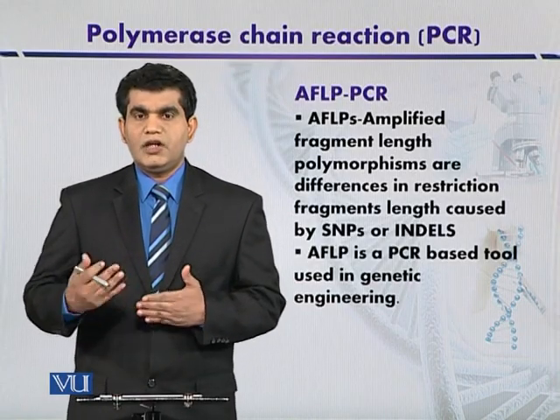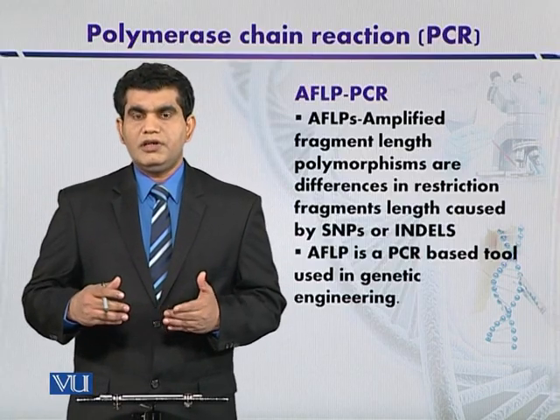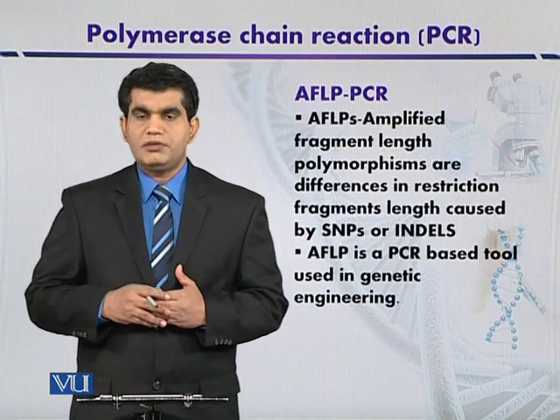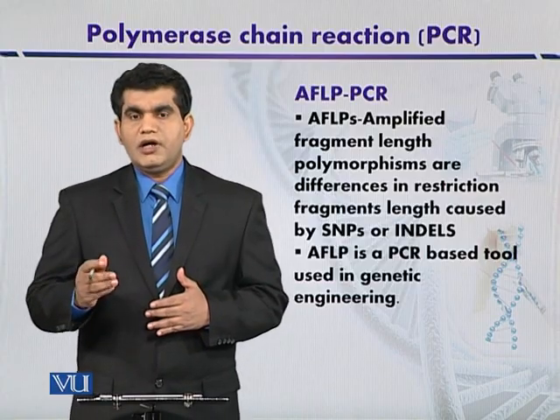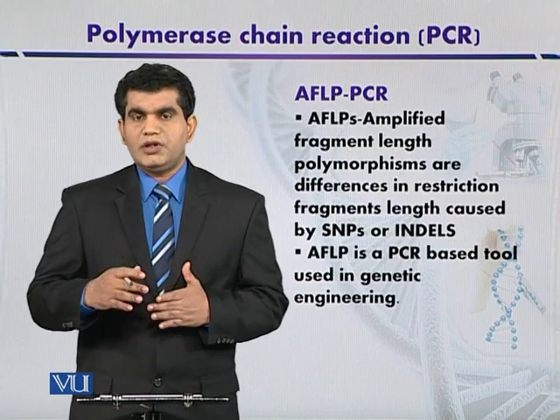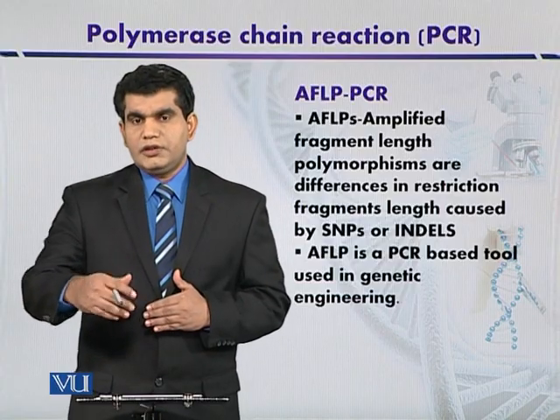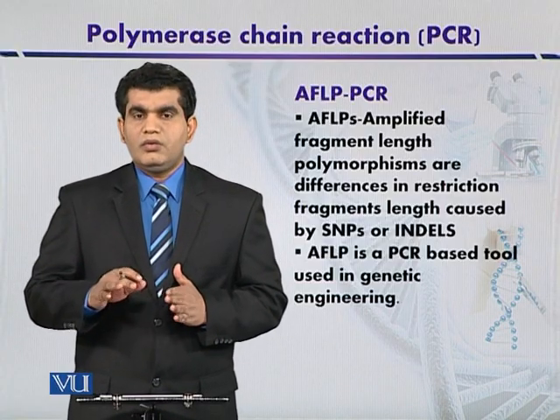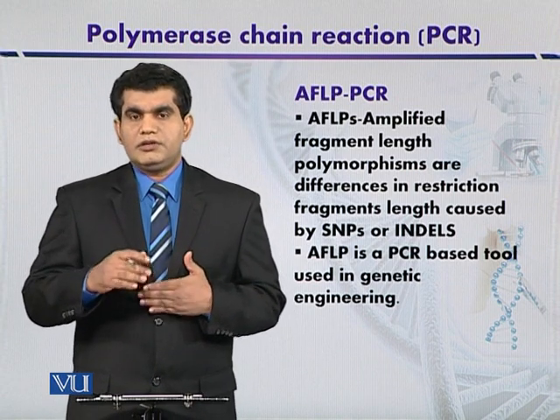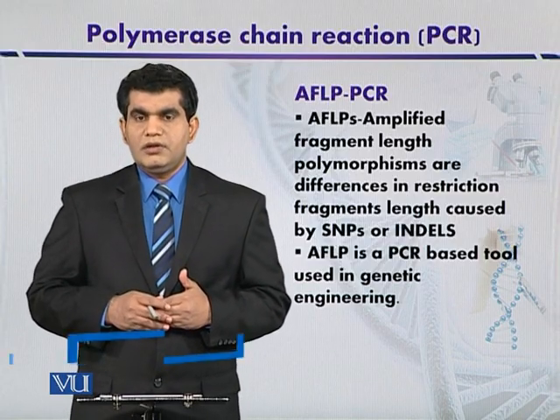AFLP is also called AFLP-PCR or simply AFLP, because this technique can be used in combination with PCR. जैसा कि हमने RFLP को डिस्कस किया, तो इसमें इनिशियली PCR का यूज़ नहीं था. सिंपली हम DNA को किसी सोर्स से एक्सट्रैक्ट करते थे और उसकी फ्रेगमेंटेशन करते थे बाय यूजिंग सर्टन टाइप ऑफ एंडोन्यूक्लियेजेस, और उसके बैंडिंग पैटर्न को हम रिजॉल्व करते थे.